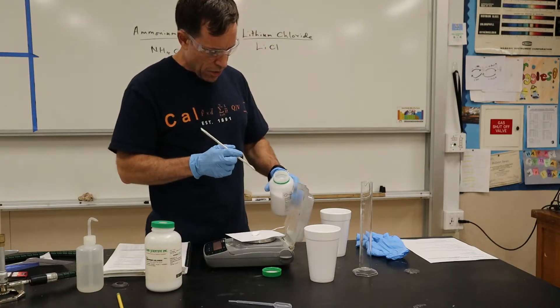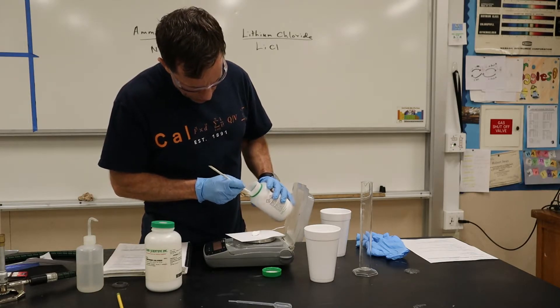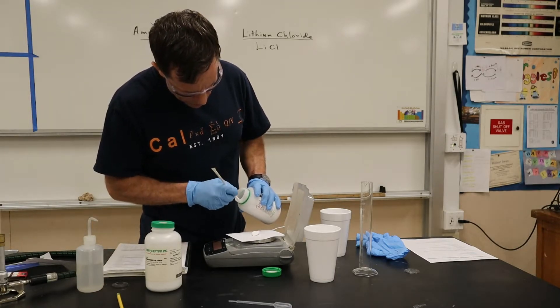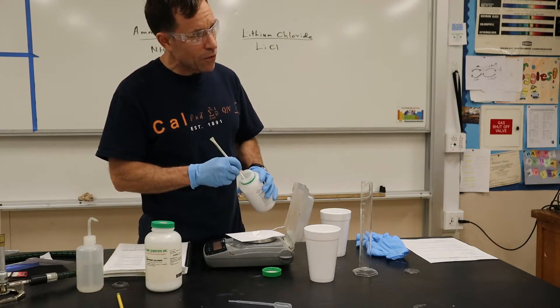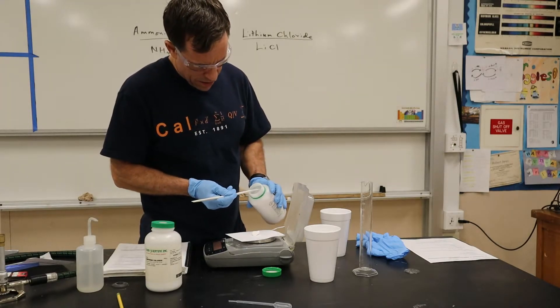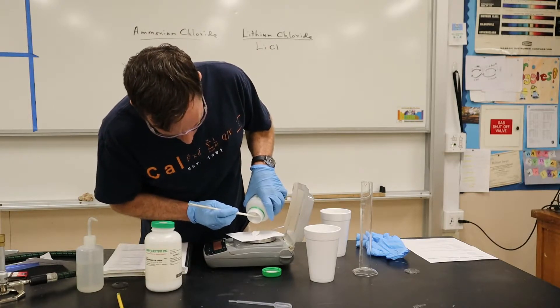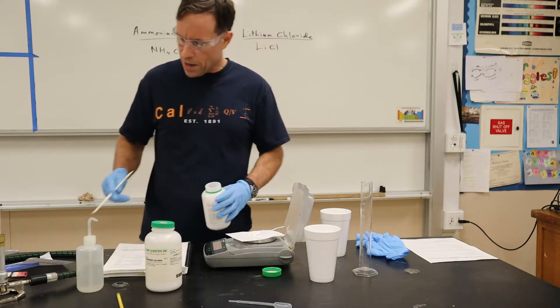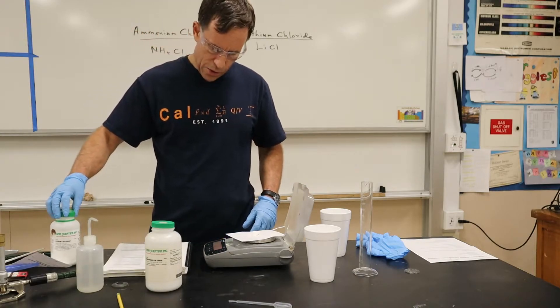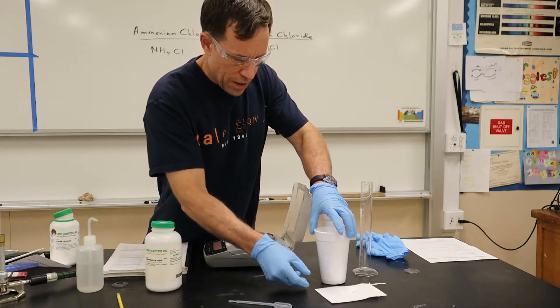Sometimes when lithium chloride gets moisture, it gets very hard to take it out. So I got 5.02 grams of the lithium chloride. That's going to be my lithium chloride sample.